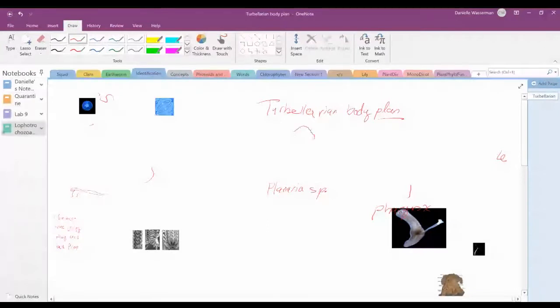So they have this same basic shape. They look cross-eyed. They're quite adorable. When I first heard about these in a book called Pets in a Jar that I found when I was a kid, I wanted one so bad. I was desperate to find one. I was told they were everywhere, and it was a while before I could find one. They live in ponds. So eye spots, if you're asked to identify these, don't call them eyes. That won't help you. They're eye spots, which are clusters of photosensitive cells, which could become an eye later on.